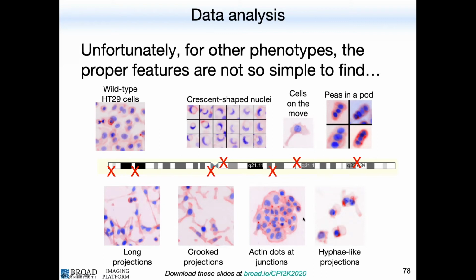The wonderful thing about creating this long list of measurements, when you may not be sure which one to use or which one is important, is that you can let the computer tell you the name of the measurement that is important, and which measurements are actually good for distinguishing different classes of what you care about versus what you don't.